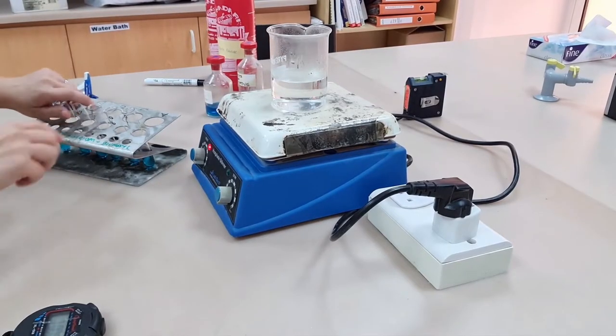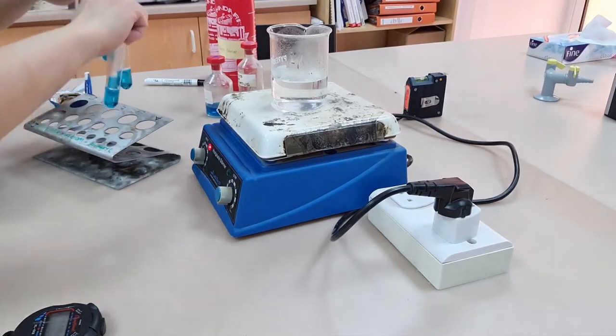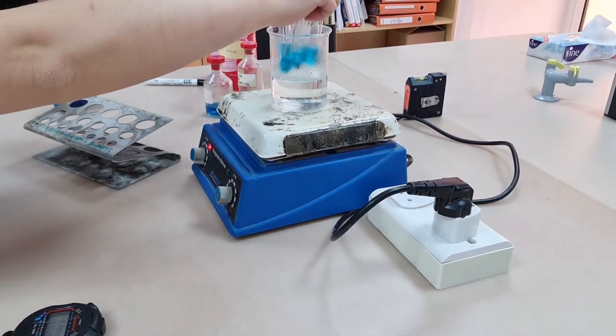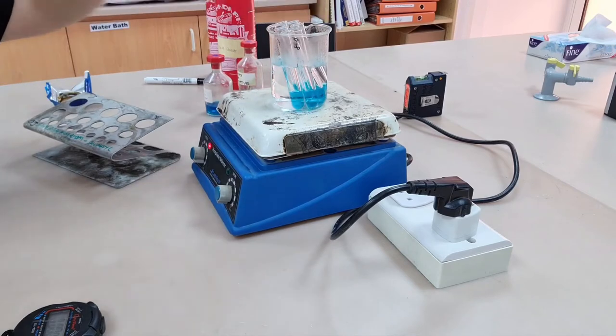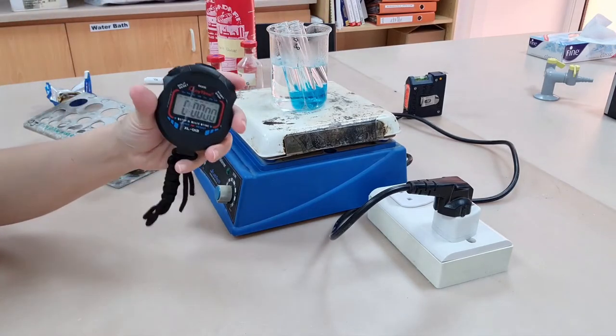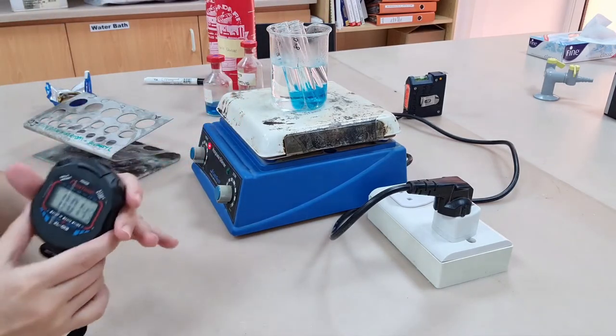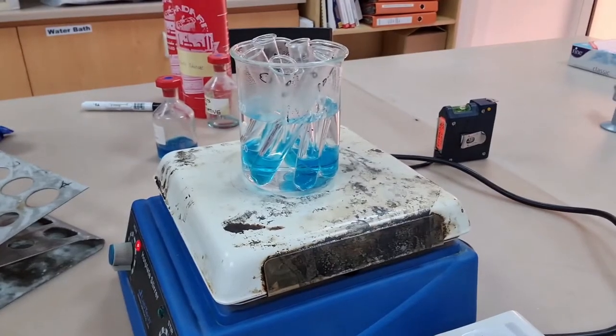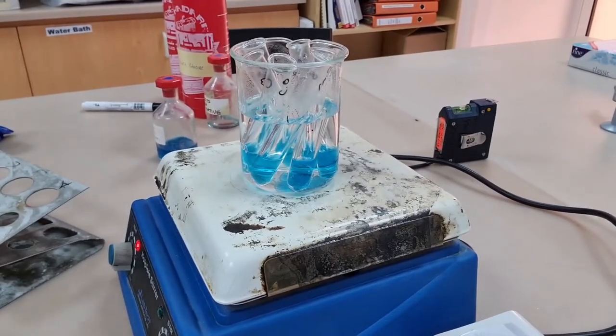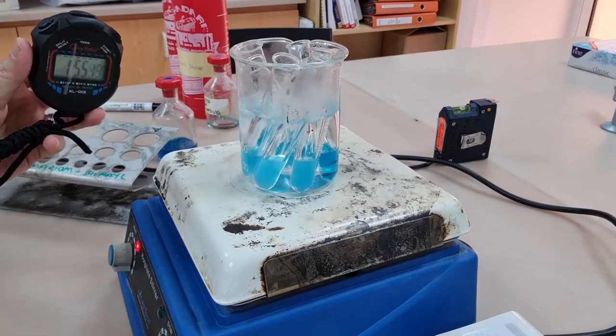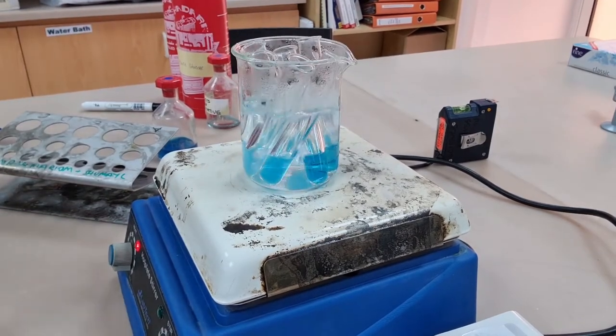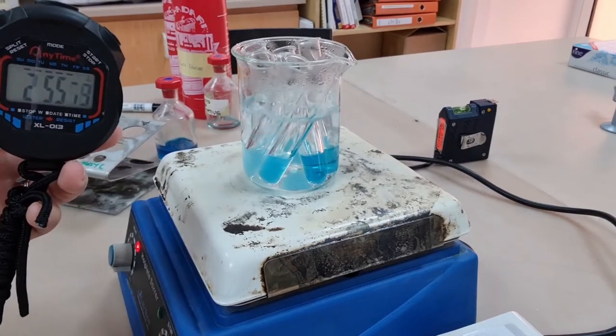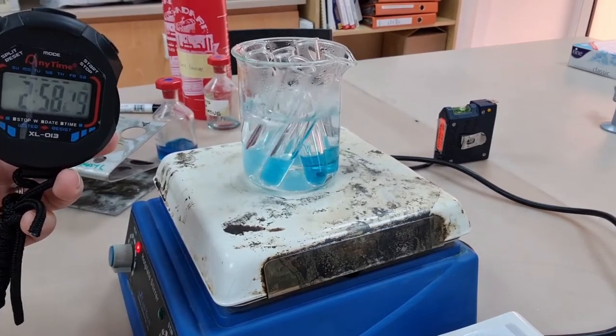Then you're going to place all tubes at exactly the same time into the boiling water bath and you're going to boil them, not heat them at 90 degrees, for three minutes. You can see that as the time progresses some of them are becoming increasingly opaque. At three minutes you can remove them all from the heat.